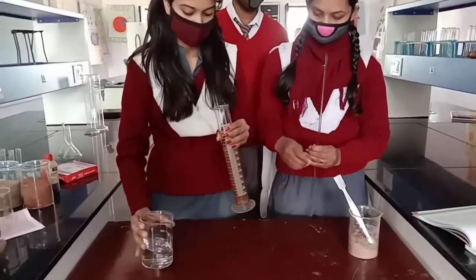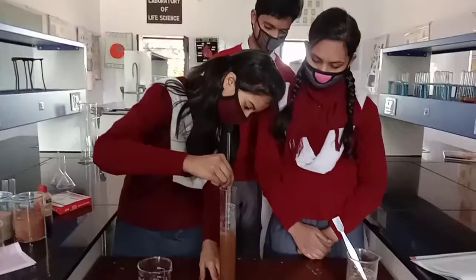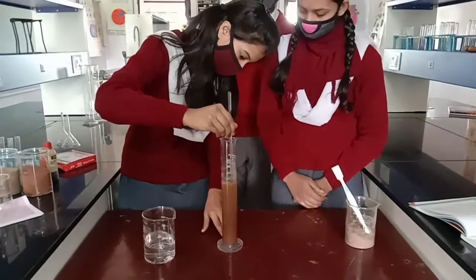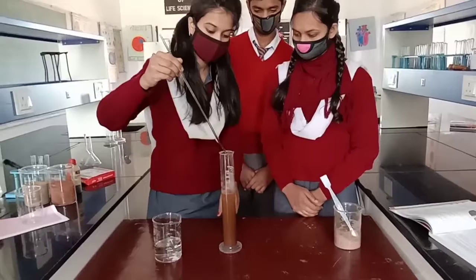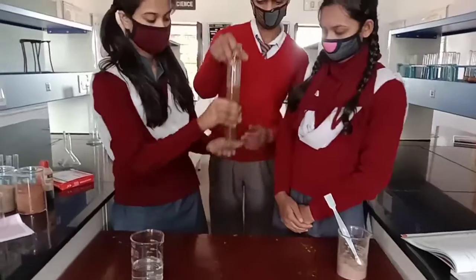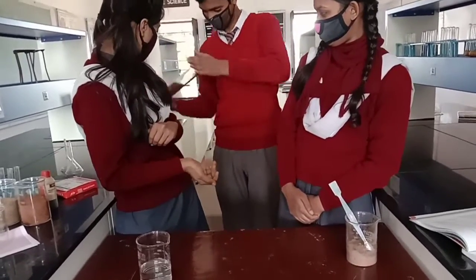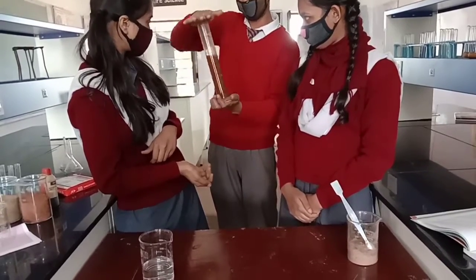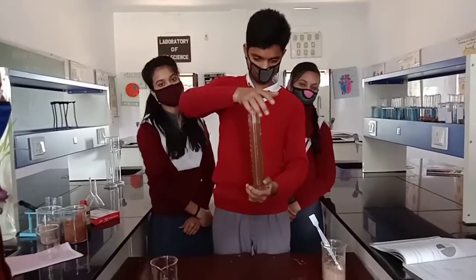We have poured water here, and with the help of a glass rod we can stir it like this. This is optional, we can do it like this, or simply shake it properly upside down. We can shake this properly so that the soil gets mixed well with the water.